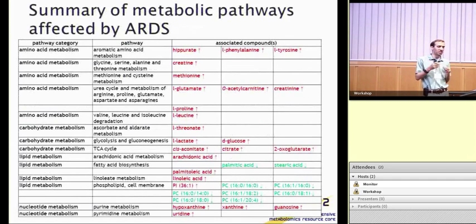Since we only had 37, they're at fairly disparate points on a metabolic network. So although Alla did a great job taking that data and putting it on pathways, we found that the most logical way to display it for the purpose of our paper was just within a table where we group things based on amino acid, on class of pathways. And this was done through pathway grouping, and Alla can tell you more about that in some detail.